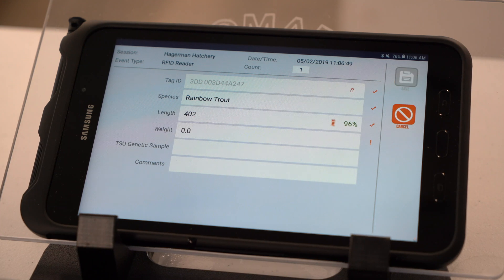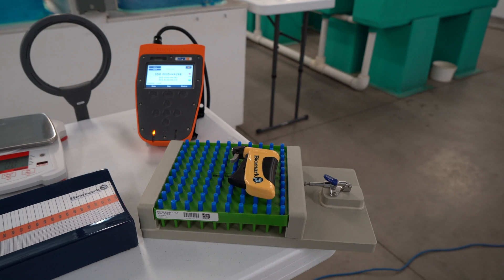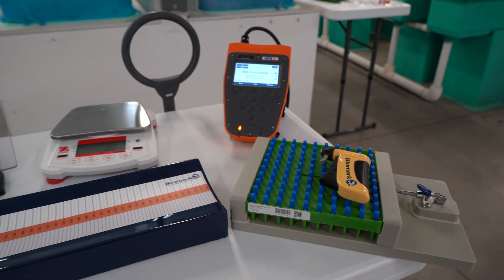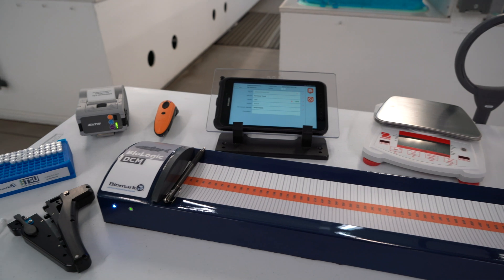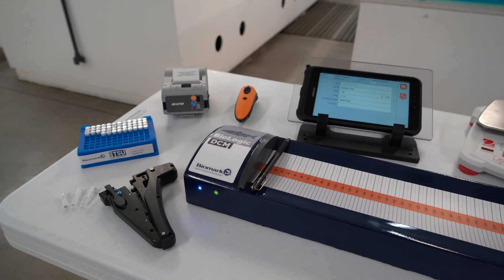Biomark's data collection module is a software application that enables users true front-end data collection. The data collection module is an extremely user-friendly program. Data fields can be added and customized easily by the end user, along with a number of peripheral devices.